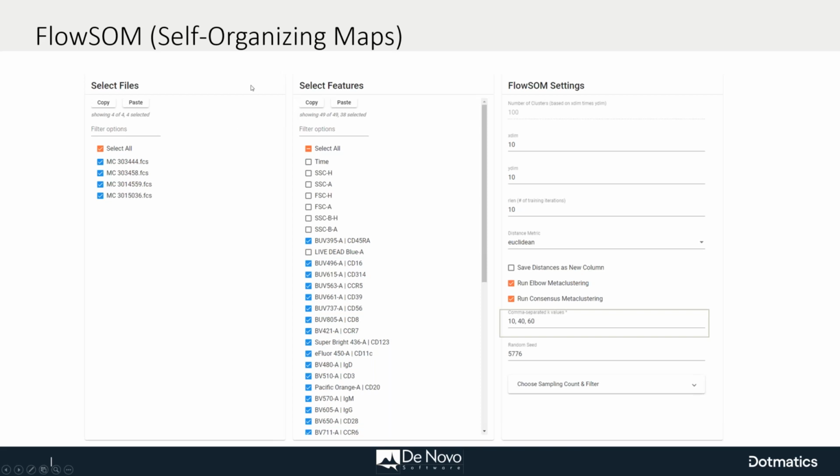A quick aside, I do want to mention that these dimensionality reduction and clustering algorithms, we're using them for cytometry data, but especially things like TSNE and UMAP and PARC and KNN, these are algorithms that are used much more broadly by the total data science community in all of their respective fields. So whether it's satellite imagery or social networking or stock market or anything like that, these are algorithms that many other people are utilizing in their own analysis needs.